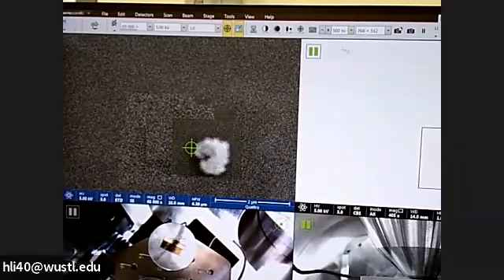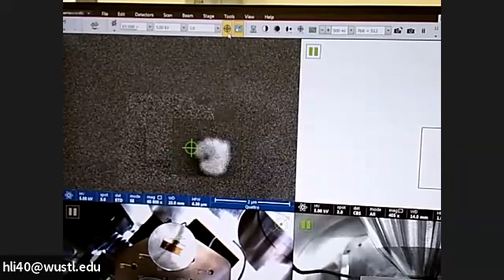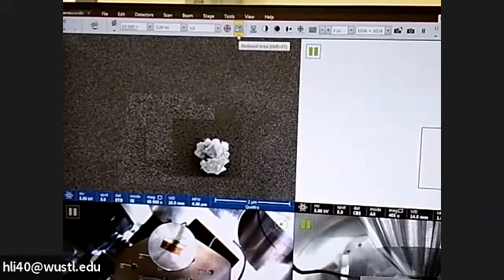Normally nanoseconds, it depends on your pixel too. So you can adjust that before you really start to tune, to make sure you can see a live changing image. Okay, this is alignment.